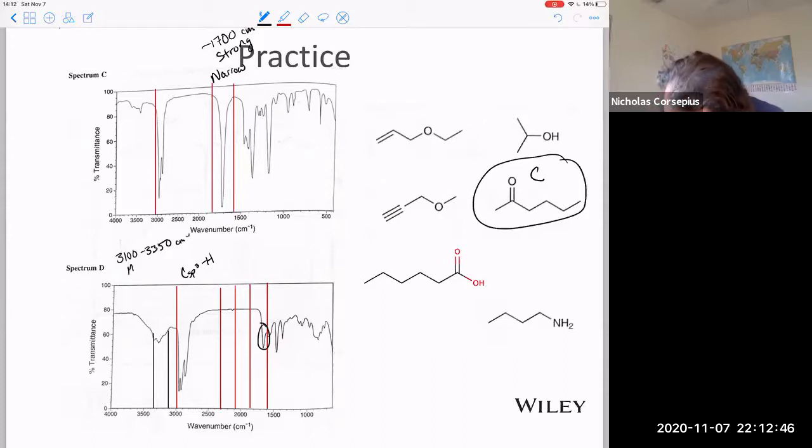They're of medium intensity and they're broad. And in fact, I have two broad peaks right next to one another, like two humps. So this is the signature of the primary amine group, right? And again, let me just move this over so it's clear.